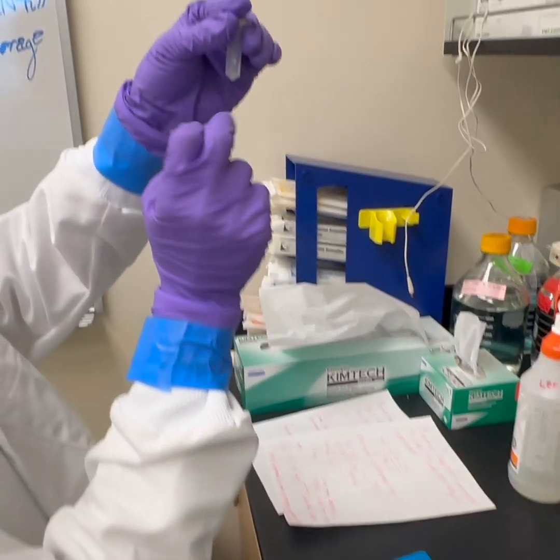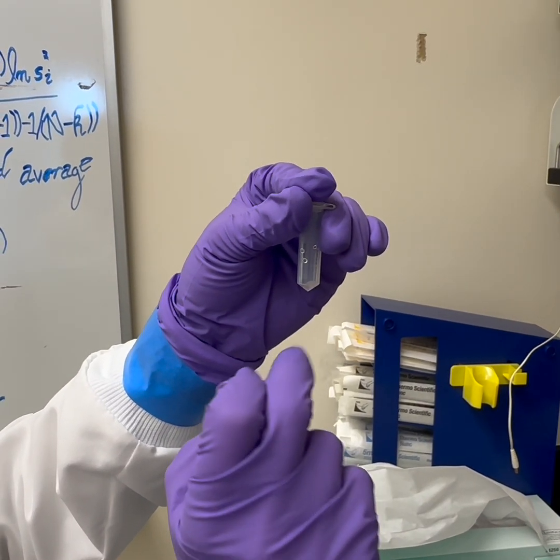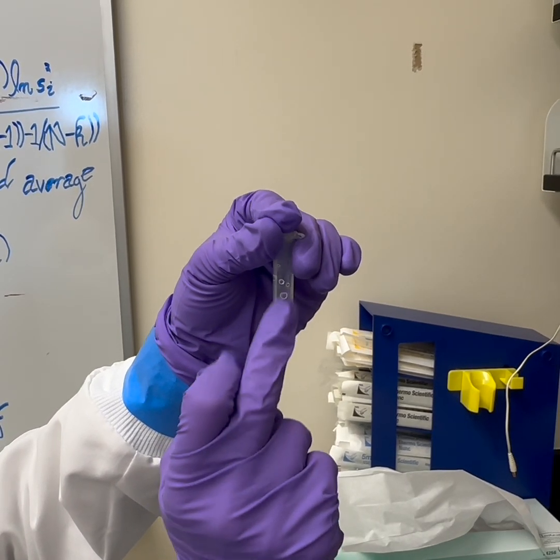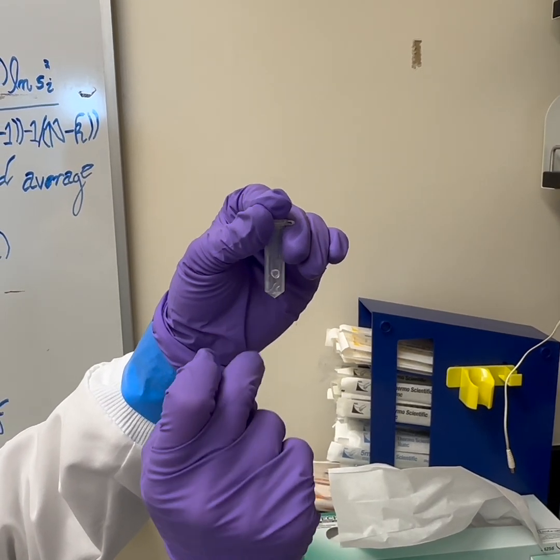So you see I'm mixing it. It's a little harder with small volumes to make sure you don't get those droplets up there and so that you're able to mix it. So you can do it either this way or you can use a micropipetter to mix it.